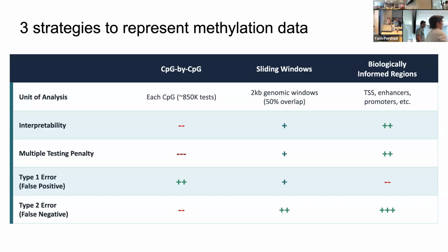There's a couple of things that you can do to recover some of that information and the power. One thing that we've been using, if you have any cross population or cross condition experimental design, which is probably a cross condition for a lot of folks in this room, I would think about using MASH-R, which employs effect size sharing.